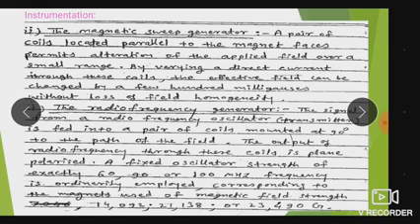So these magnetic sweep generators are used for maintaining field homogeneity, because they produce a few hundred milligauss of field change without changing the homogeneity, by varying the direct current.